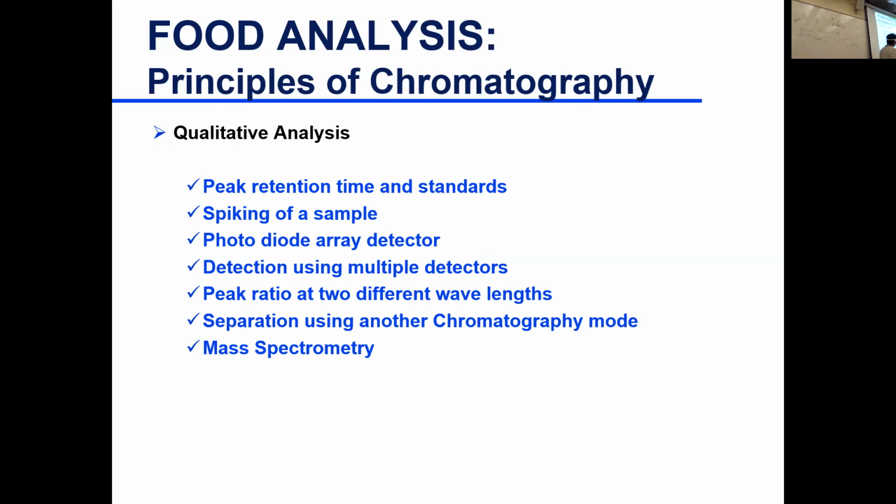Sometimes you have compounds that have the same lambda max. So what is lambda max? Those of you that took the HPLC lab, what is lambda max? What's lambda max? Abi? To get the maximum. Maximum absorption. So it's the wavelength at which we get maximum absorption.